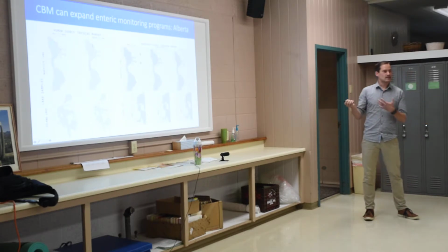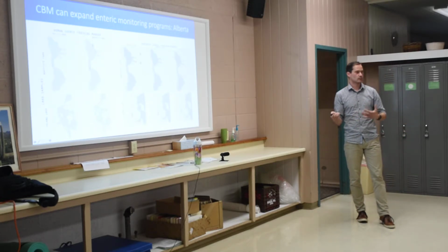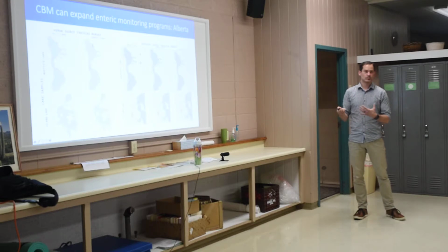This is sort of that A model CBM where the community was collecting all the samples and then they just brought them to us. But as we move forward with this now, we're going to get a qPCR machine to these people so they can start running their own tests. The point though is that you can start doing some really comprehensive testing.